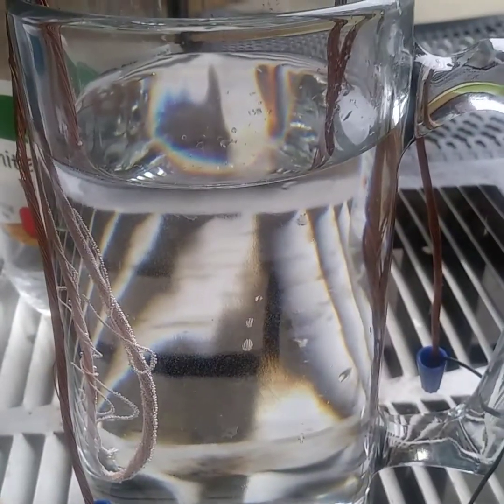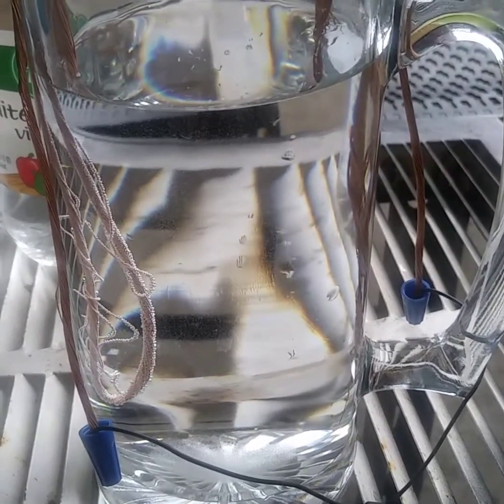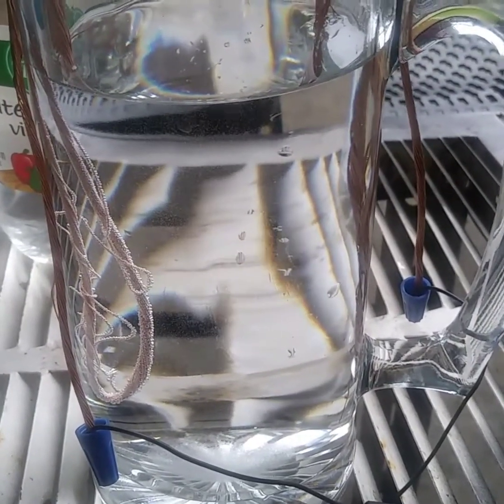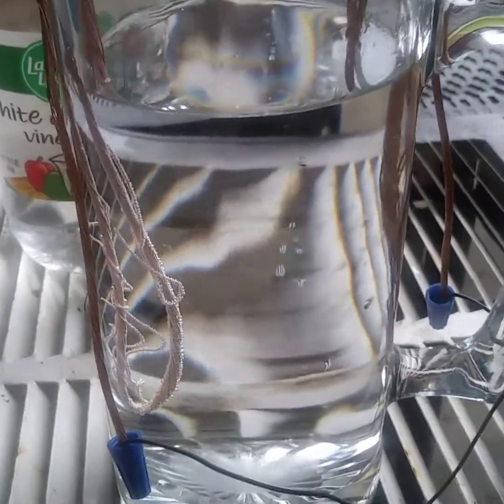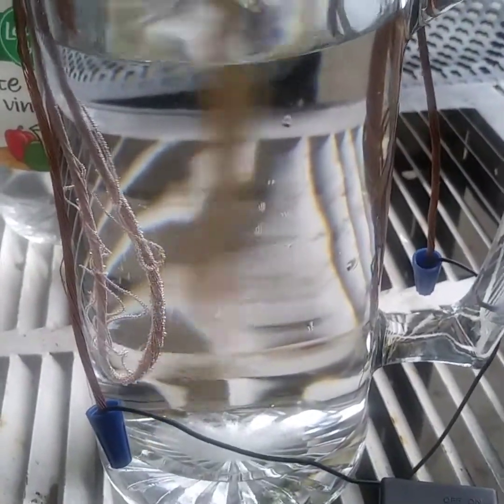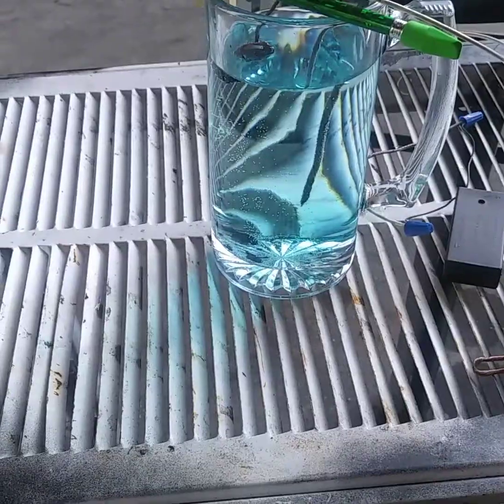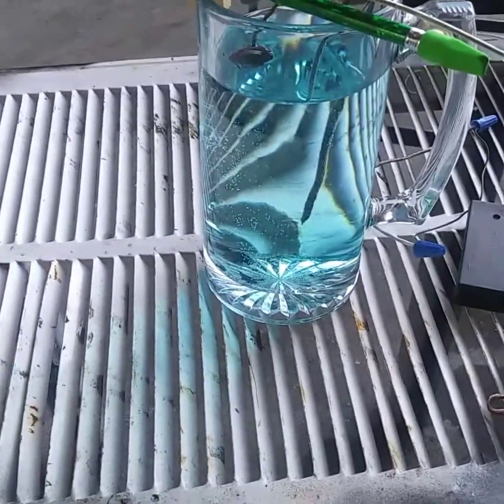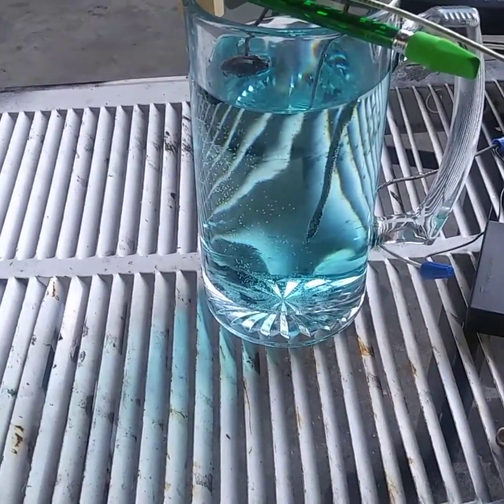Now we're just going to set this out of sight, out of mind for a few hours until the solution turns blue. And once it turns blue, we'll have our copper acetate solution. I just woke up, it's been 8 hours, and this is what your solution should look like now. It should be like a light baby blue.